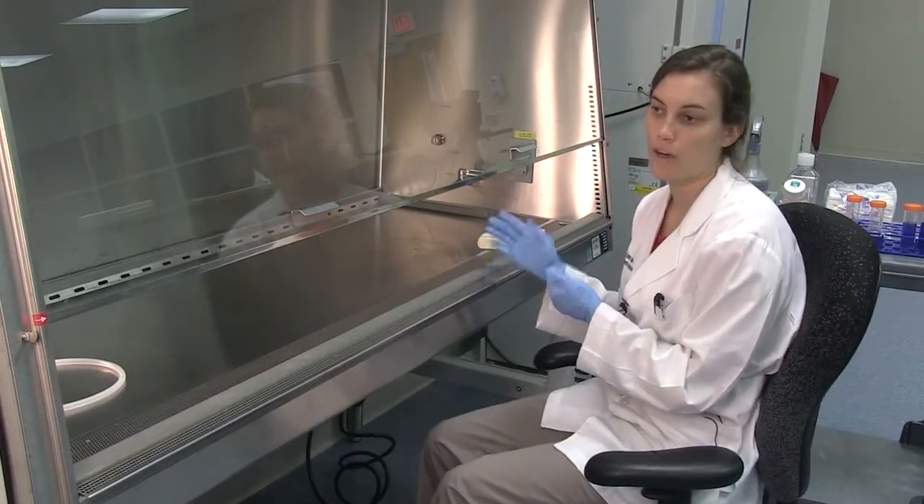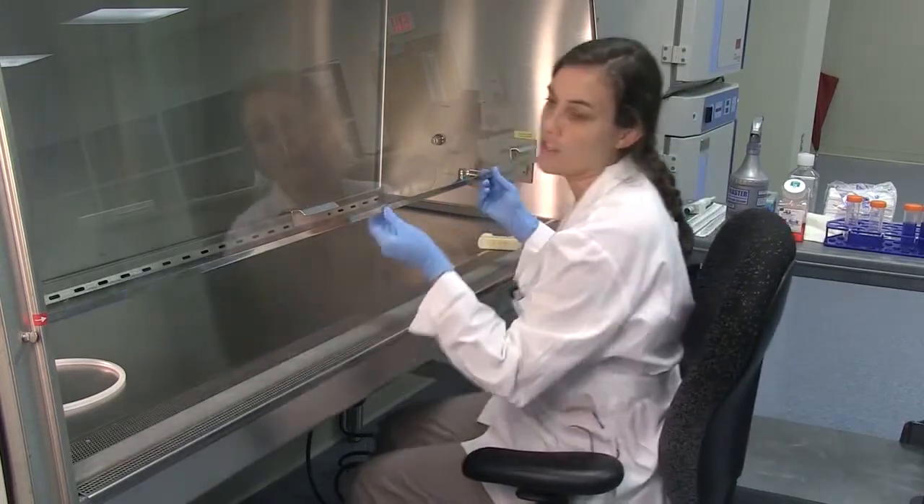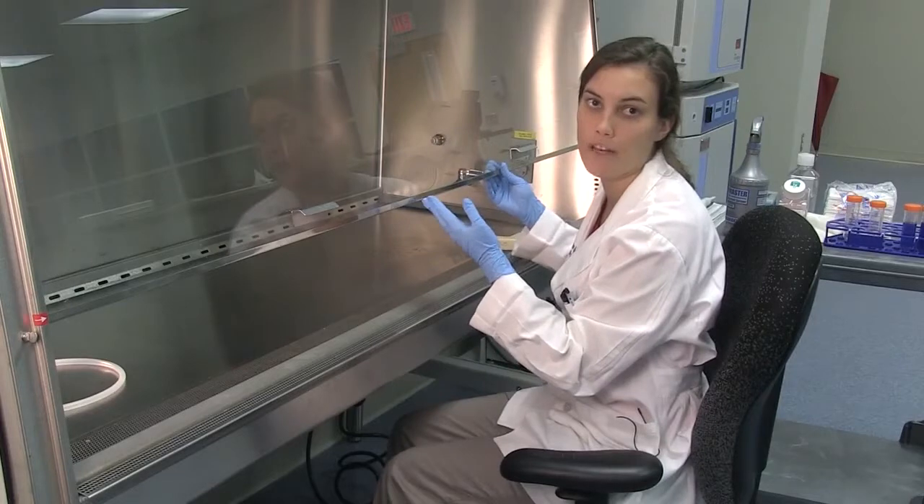This is done in a laminar flow hood. You move the front of the hood up — there are usually marks or indications showing how high it needs to go to maintain proper air flow inside the hood.